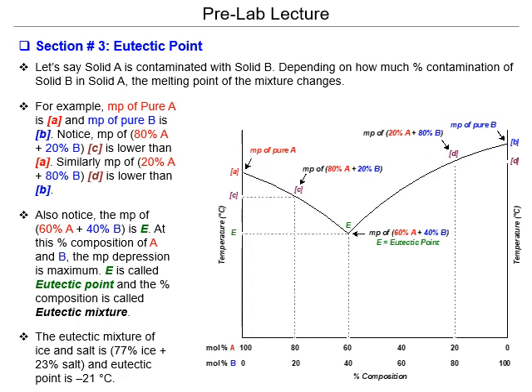So on the far left you have pure A, on the far right you have pure B, and that dip point that's labeled E, that's where you have the lowest temperature, and that's very, very important. So the thing to note is the lowest melting point temperature of a mixture of different components like we have in this case. That's called the eutectic point. Eutectic, E-U-T-E-C-T-I-C. And also this is called the eutectic mixture.